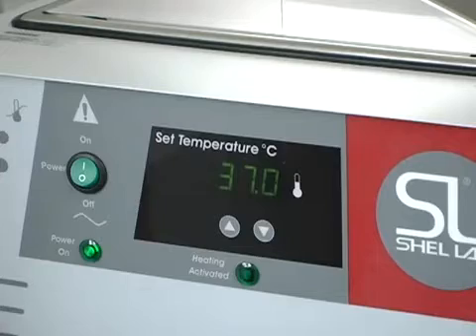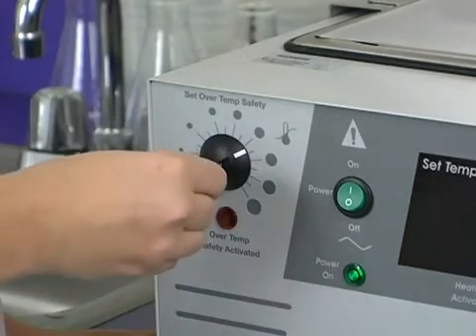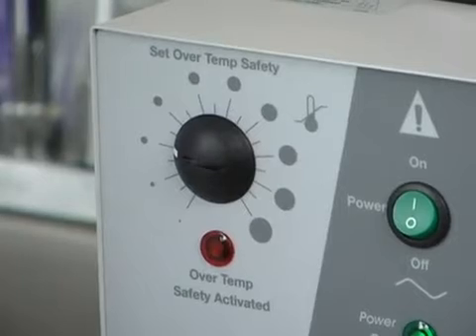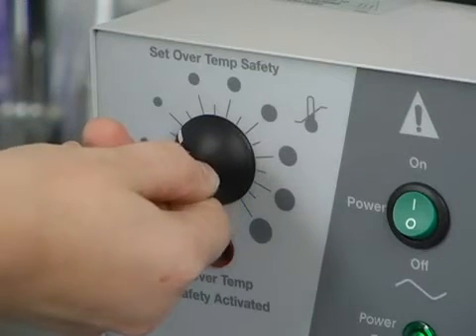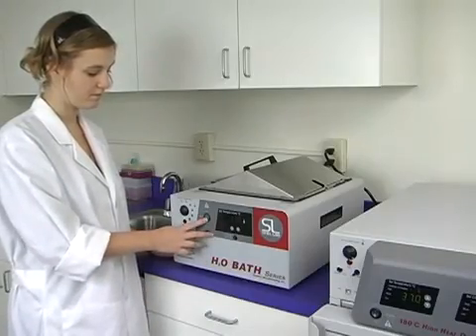Each Shell Lab water bath is equipped with a safety thermostat to prevent the bath from overheating. To set the safety, turn the thermostat counterclockwise using a flathead screwdriver or a coin. Once the over-temp safety-activated light begins flashing, slowly turn the dial forward until you hear a soft click and the light stops blinking. This means the safety thermostat is set just above your operating set point.